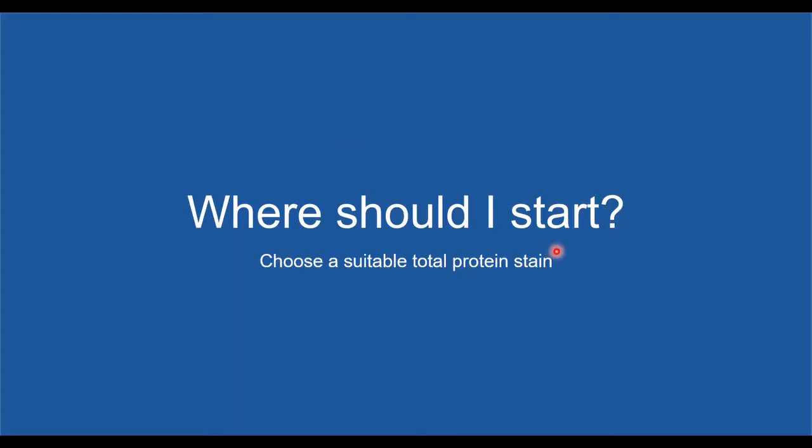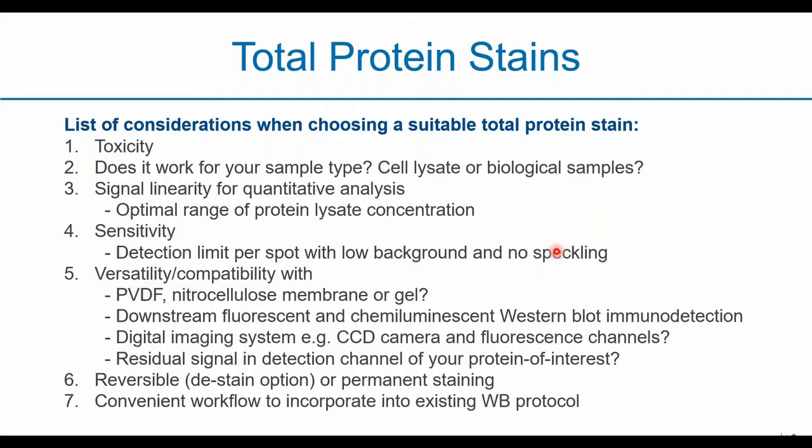Okay, so if you recognize the benefits of doing total protein stain and you're interested in it, you might be wondering, so where should I start? So the first thing is you need to know how to choose a total protein stain. Here's a list for you to consider when you're choosing a suitable total protein stain. Firstly, of course, toxicity. Okay, it shouldn't be toxic to humans.